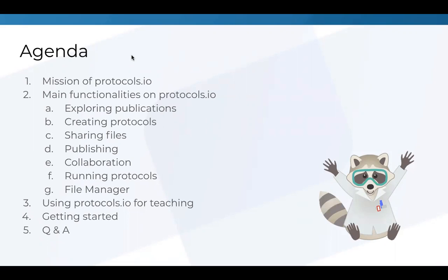And then I'm going to give you a quick overview of why it's good to use Protocols.io for teaching and show some examples for using Protocols.io for teaching in classes. And then I'm going to show you how you can get started with setting up your premium account using your Carnegie Mellon email address. And then in the end, we have time for questions and answers.